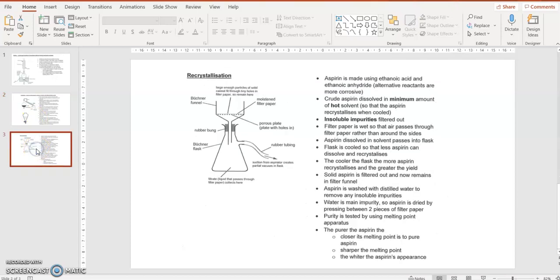And similarly for the Buchner funnel, yeah, that's how you draw a Buchner funnel. So for vacuum filtration, make sure everything's sealed in this case. And you can just draw a line across with moistened filter paper. And the top part, it comes in two sections of Buchner funnel, so you can draw a straight line going across because that's perforated with holes.